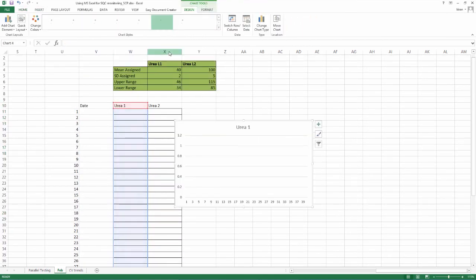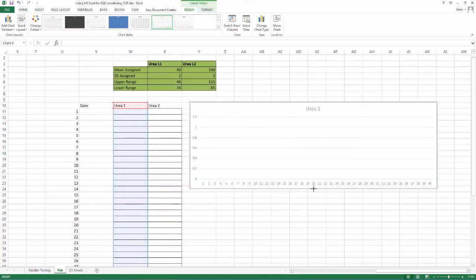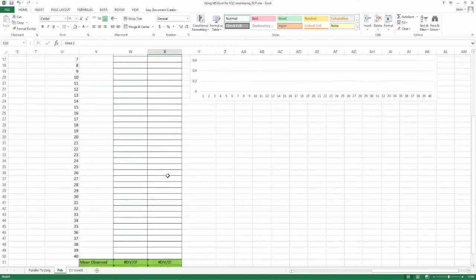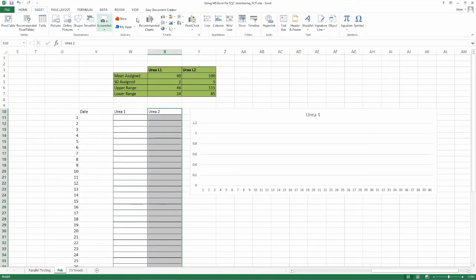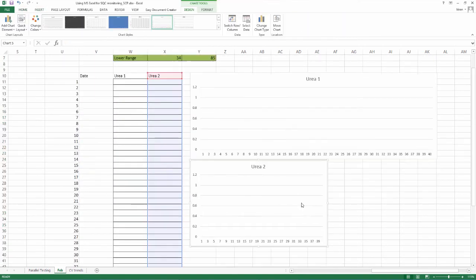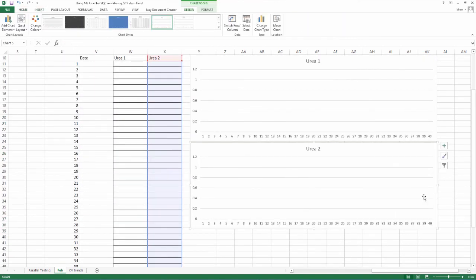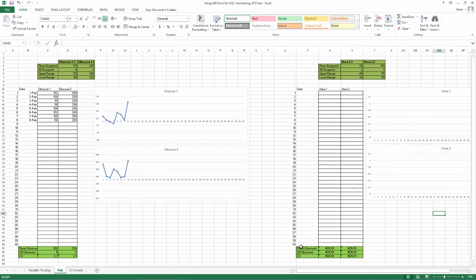The formulae will be present in the copy-pasted version. However, graphs will have to be constructed as instructed earlier. The excel sheet is very broad and will lend itself to including data of several parameters thus. However, the user may decide how many parameters they want to use on one sheet.